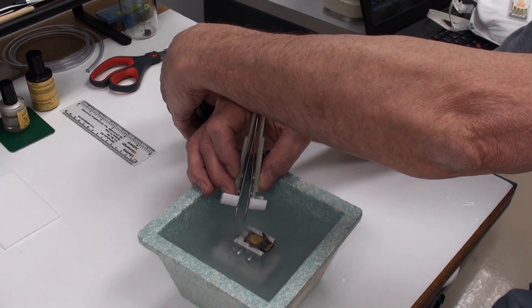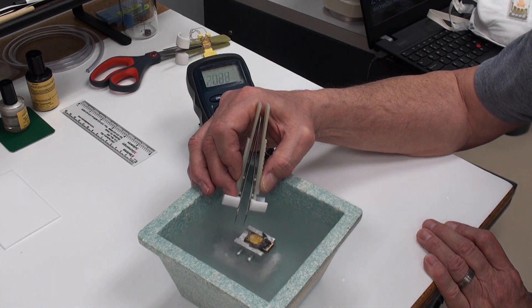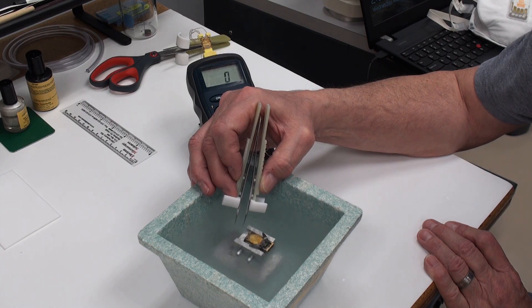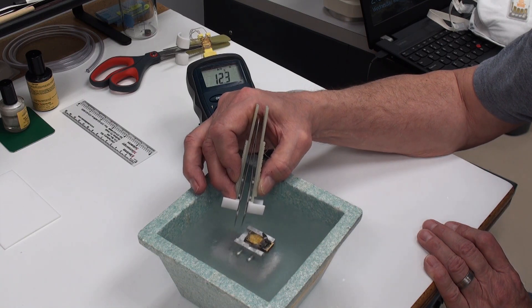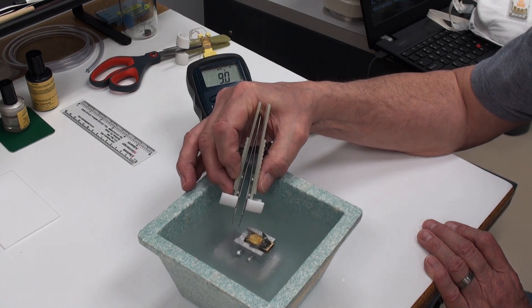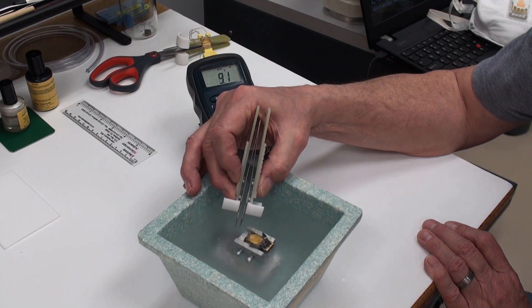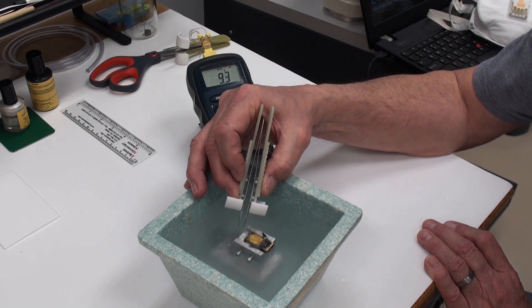Oops, my meter shut off. I didn't turn it on the constant. So excuse me while that reboots. So now after going even deeper, the forceps are at liquid nitrogen temperature, but our fingers are about 10 degrees.